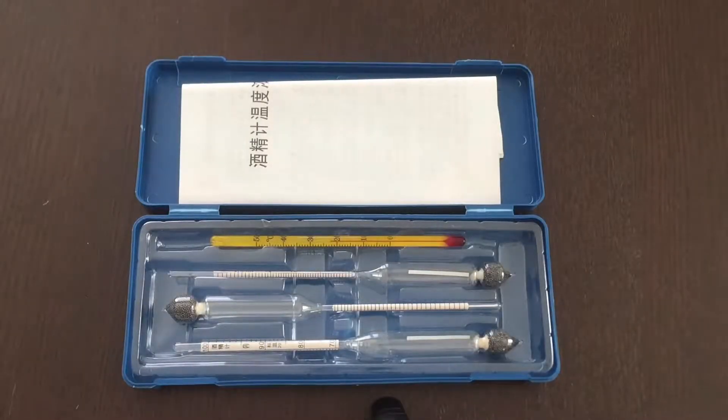My ethanol hydrometer came in the mail today and I wanted to test it out. For anyone that is looking to build a chemistry lab or you're looking to acquire some chemistry equipment but you don't want to waste money on things that are just cheap junk, this video is for you.